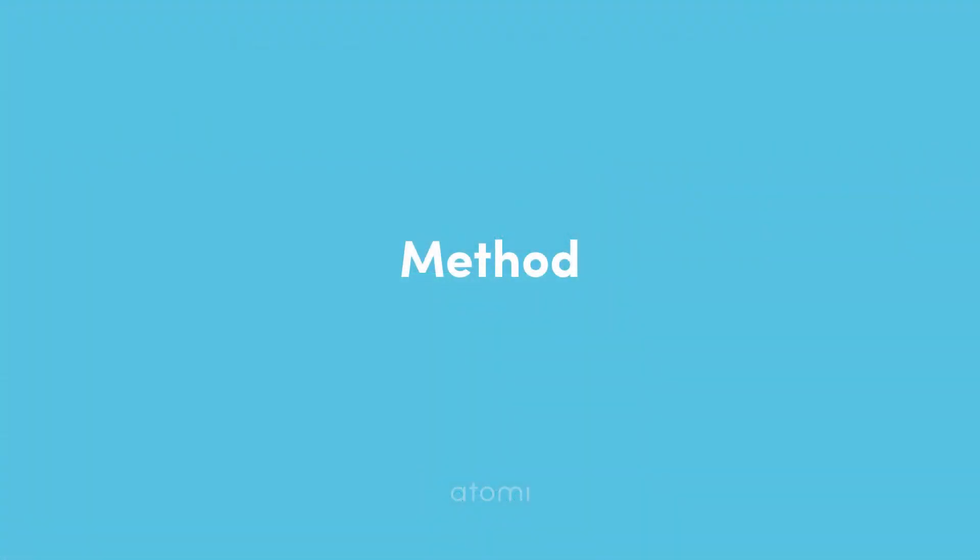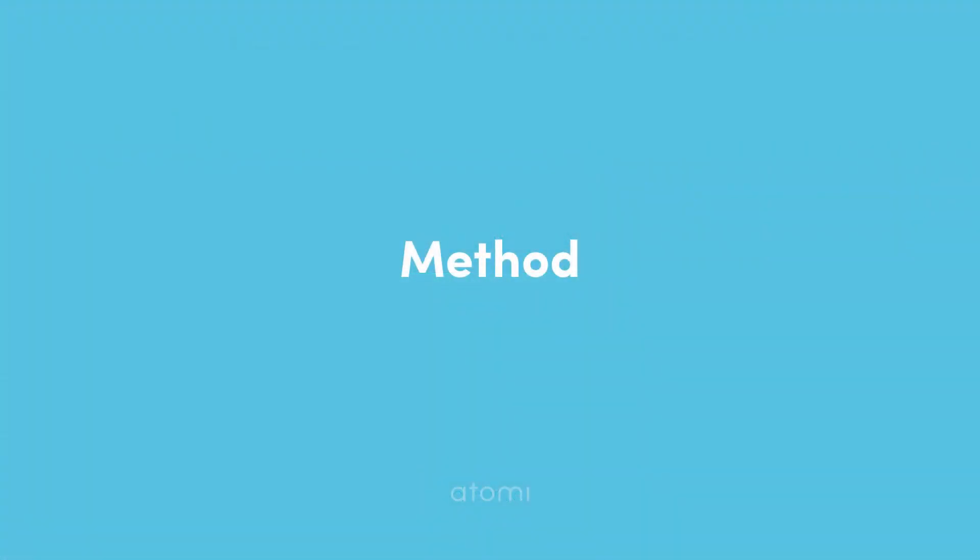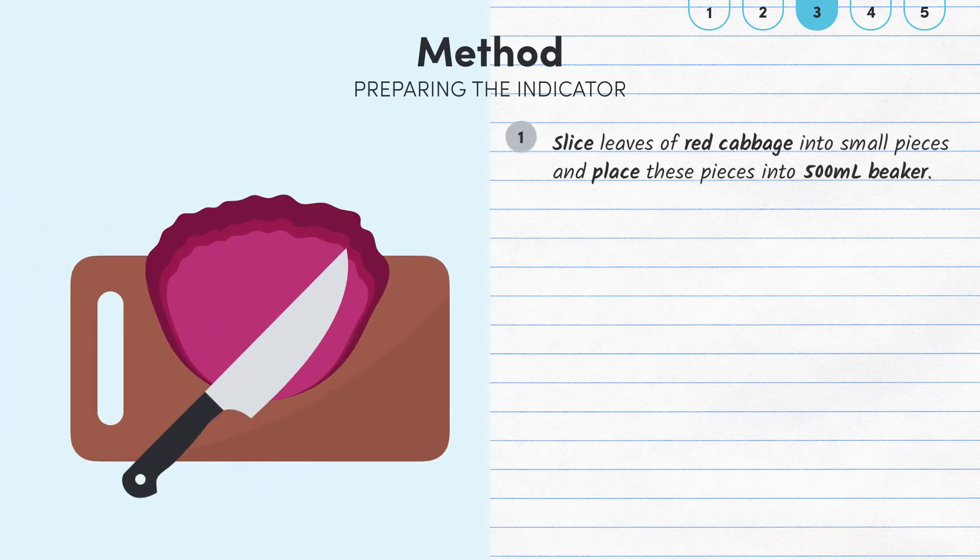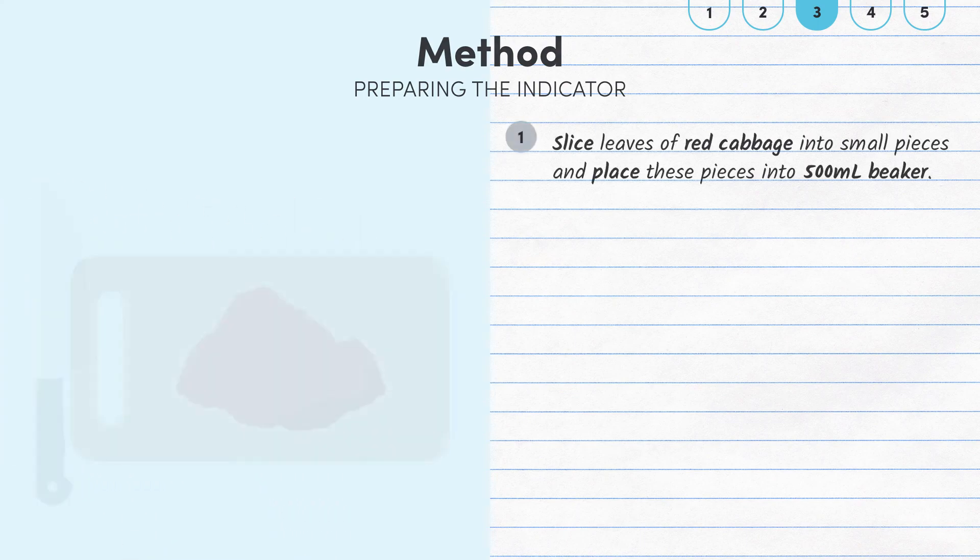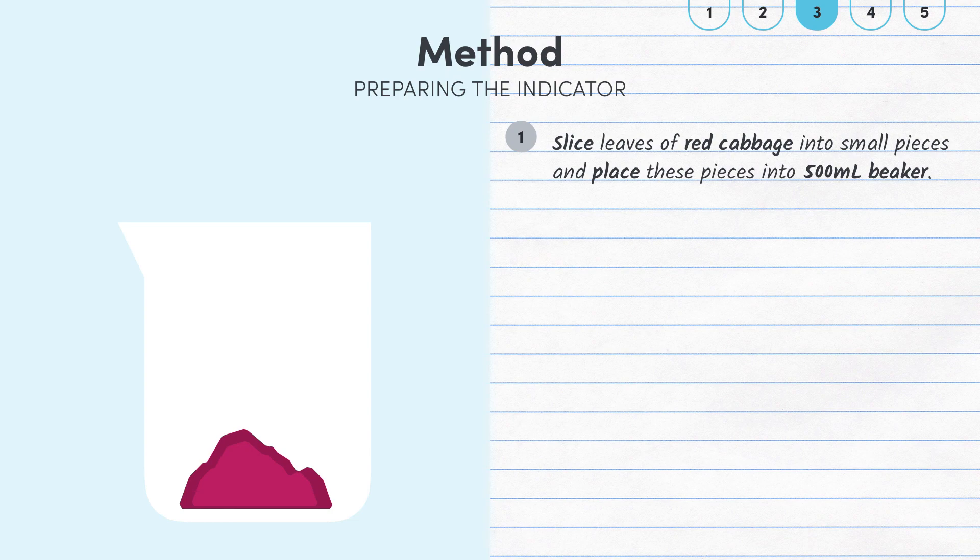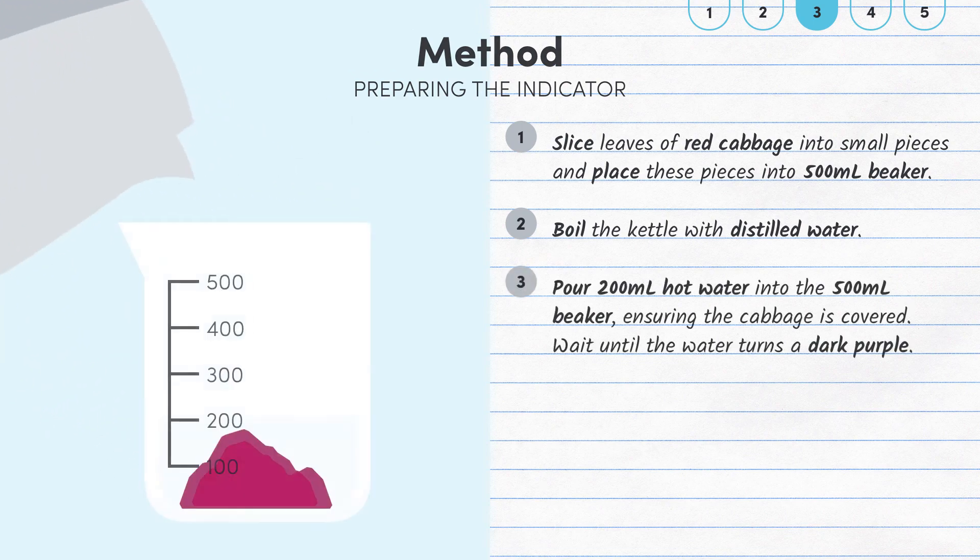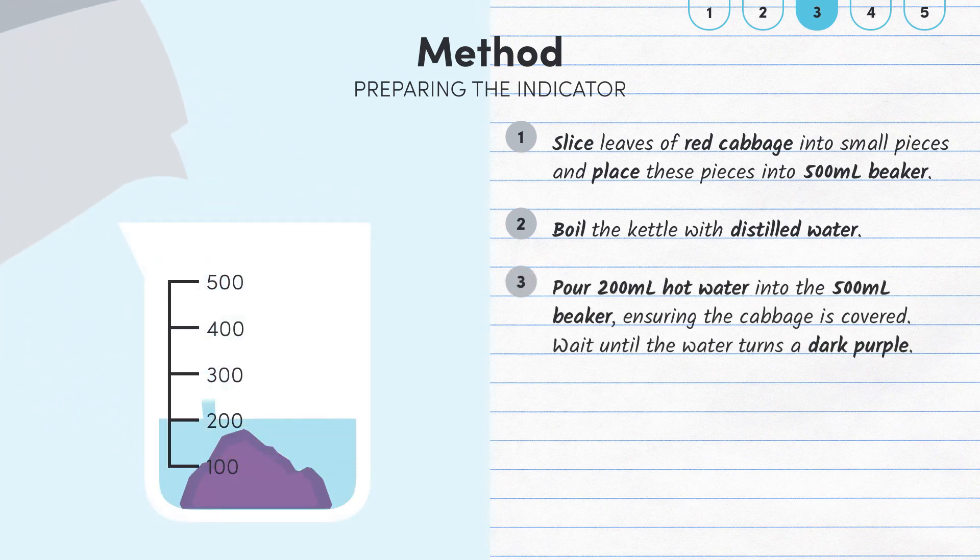So now that we've considered the hazards, risks and precautions, we can get into the method. Slice the leaves of red cabbage into small pieces and place these pieces into a 500ml beaker. Boil the kettle with distilled water. Once the water has boiled, pour around 200ml of hot water into the 500ml beaker, ensuring the pieces of red cabbage are covered. Wait until the water turns a dark purple colour.